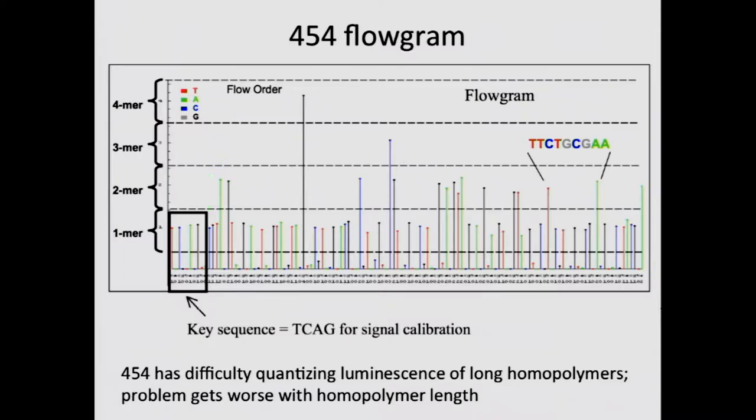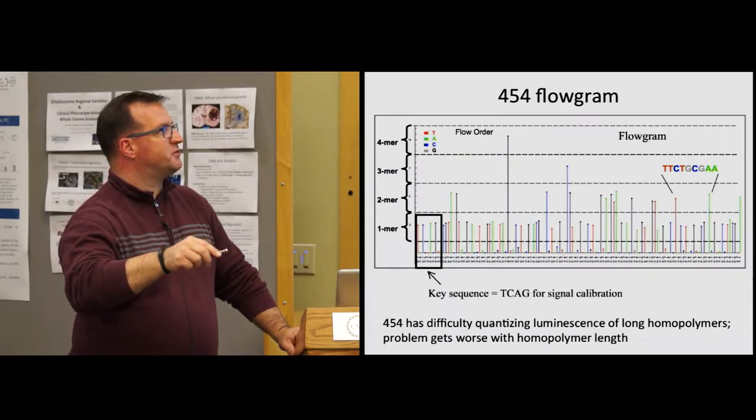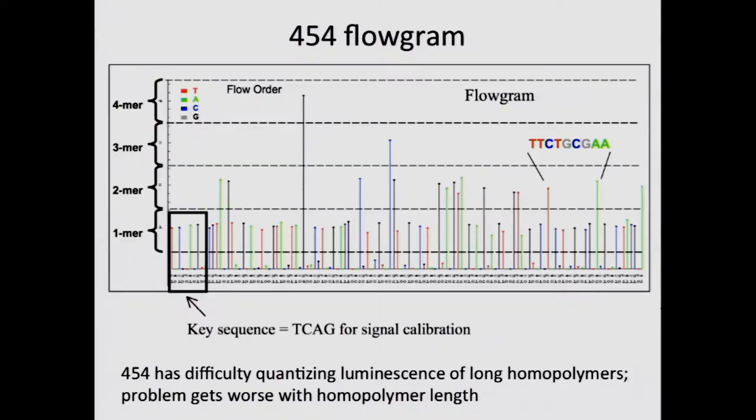And then it's pretty easy to distinguish two base from one base incorporations, and probably even three versus two, but then things get a little bit fuzzy, because if you go to four or five or six, first of all, they're relatively rare. And because they're rare, it means that the signal processing algorithm that has to parse through all this has to figure out: where's the line that distinguishes between one and two? Where's the line that distinguishes between three and four? Where's the line that distinguishes between eight and nine, when you really might only have two examples of an eight or a nine in a given run? It's hard for the software to actually figure out where that's going to be.